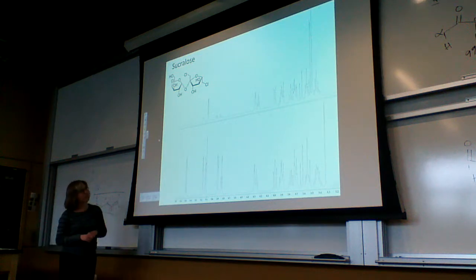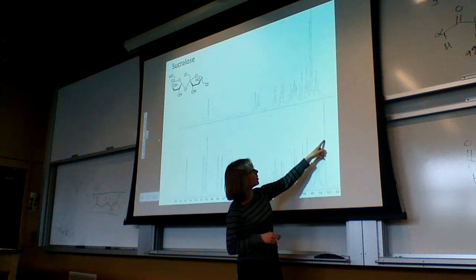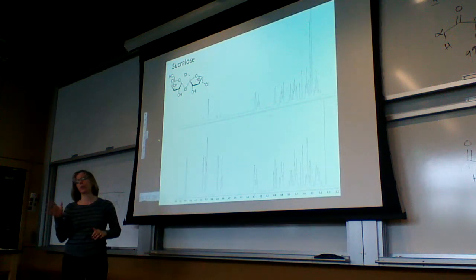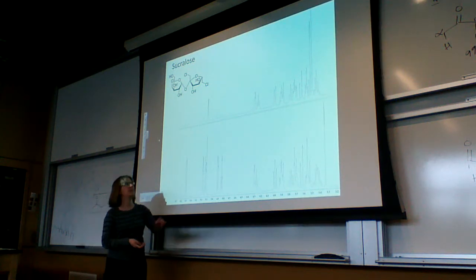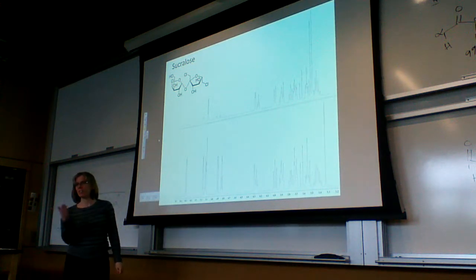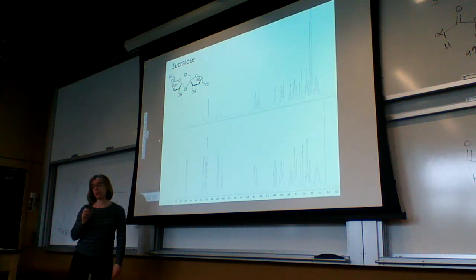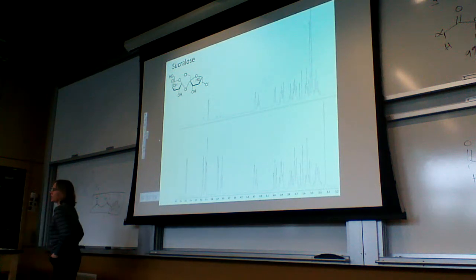The one other thing that you'll note here when you do this, this is a residual water peak at 3.3. We were working in DMSO, so it usually shows up right around 3.3. When we added the D2O, you get an increase in that peak, and you hope it doesn't overlap the rest of your peaks. And it did shift a little bit. Those can shift a little bit depending on their concentration. And so there's a slight change there from the addition of the D2O. Any questions on that?